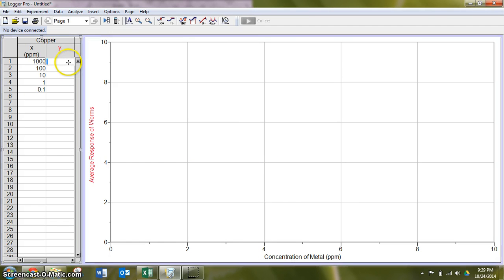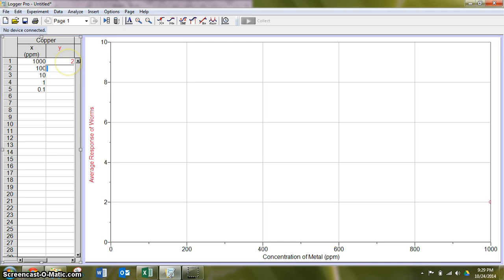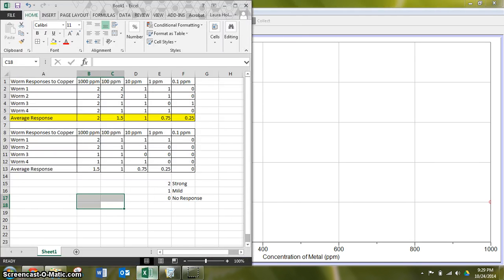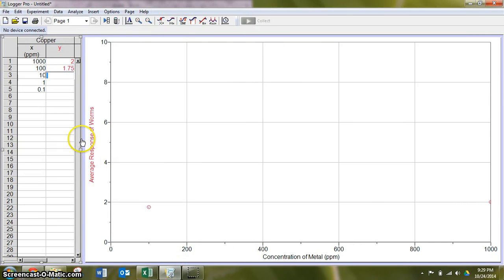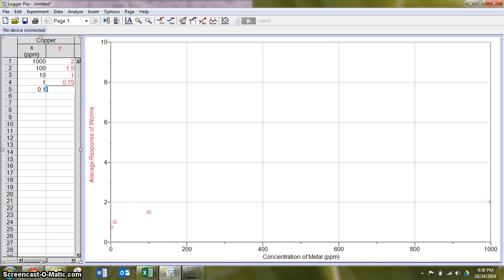So 2, 1.75, double check here. 1.5, I'm sorry. 1, 0.75, and 0.25.